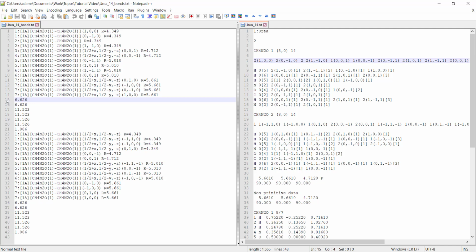So even though topologically they should be stronger bonds, there may be a higher penalty for desolvation in certain solvents versus the energy regained when adding to the crystal. So it doesn't necessarily mean that a stronger bond would mean a stronger free energy of crystallization, because it cuts both ways. It may be a stronger interaction with the crystal, but it's also going to have a stronger interaction with the solvent. So these are likely going to require adjustment.